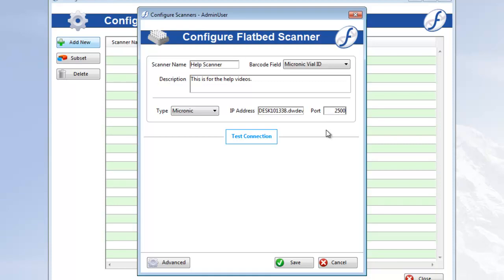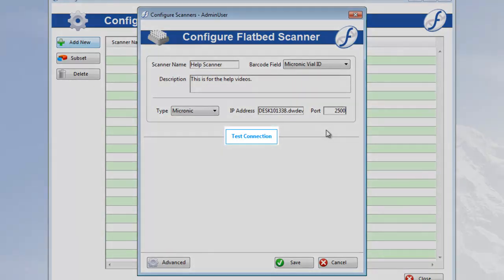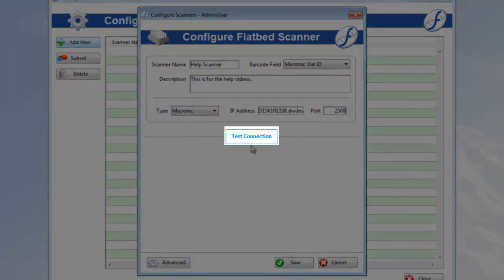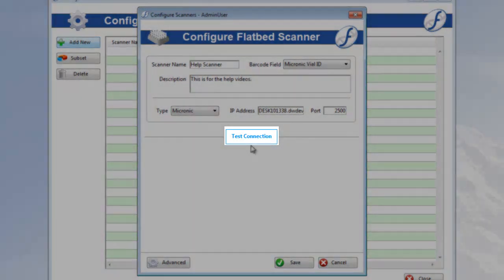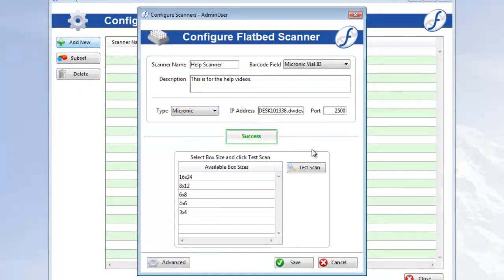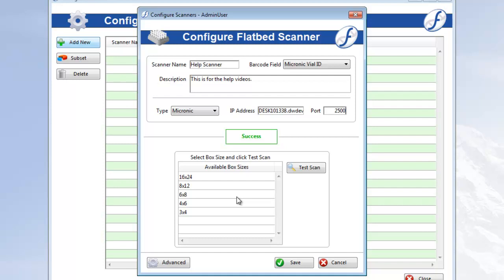Once all these fields are filled in, the Test Connection button becomes enabled. Click it to load your scanner's box sizes. If the connection doesn't work, you'll be alerted and told what needs to be fixed. The scanner's box sizes are set up in the scanner software itself, and we just pull that data.